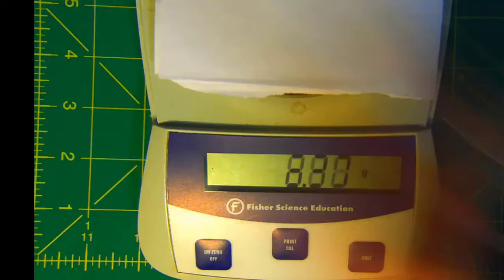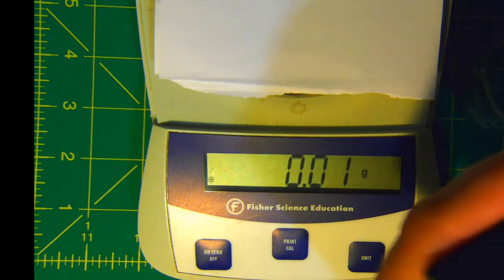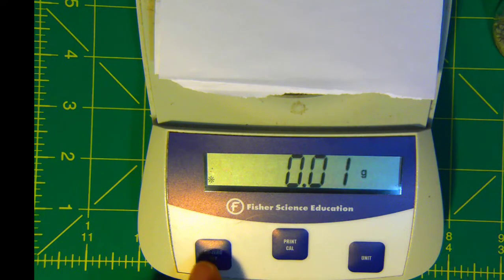And then we'll take that off, and as I mentioned, we're going to add some sand to this instead of the sugar. So there's a little bit of sand, and you know what, it looks like we are a little bit off now, so I'm going to re-zero that.